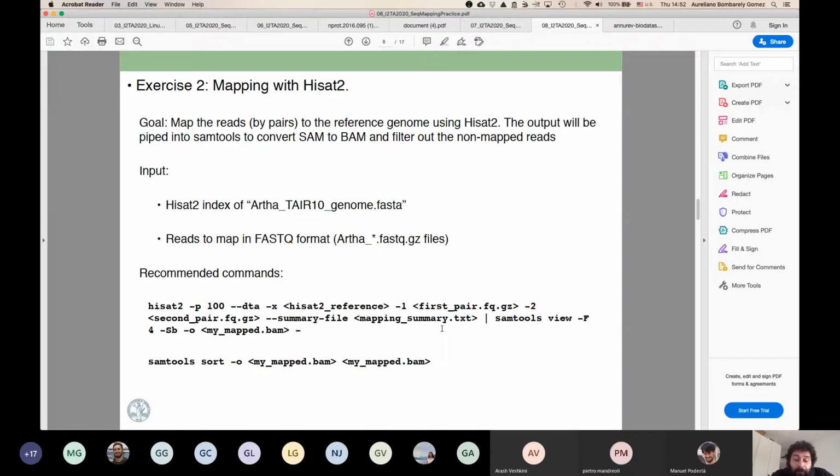from a pipe. Okay, okay. Yeah, it's okay. Otherwise, the tool will wait until the input comes to the command. Because if for some reason you don't add this dash at the end, SAMtools is going to wait to have some dash I that is the input. Yeah. That's okay, thanks.